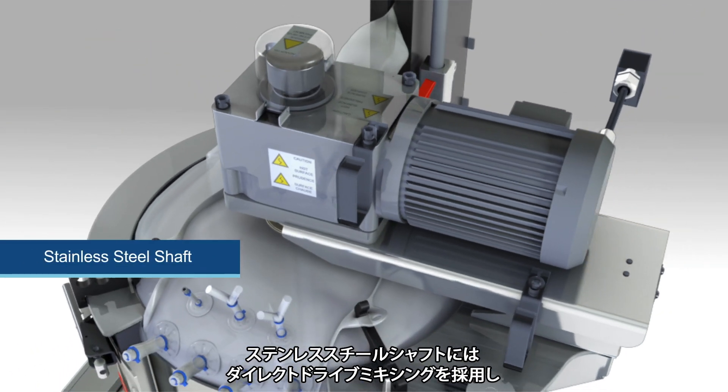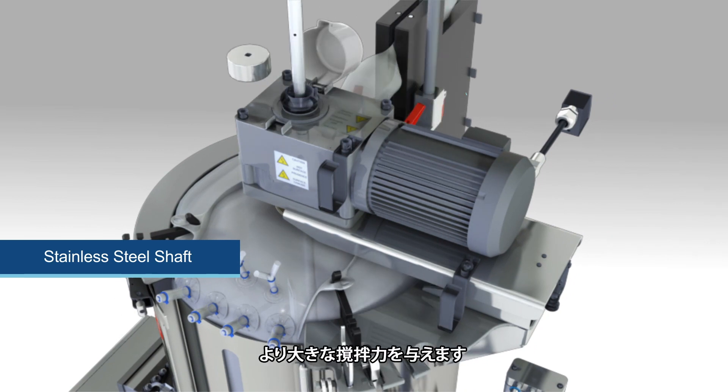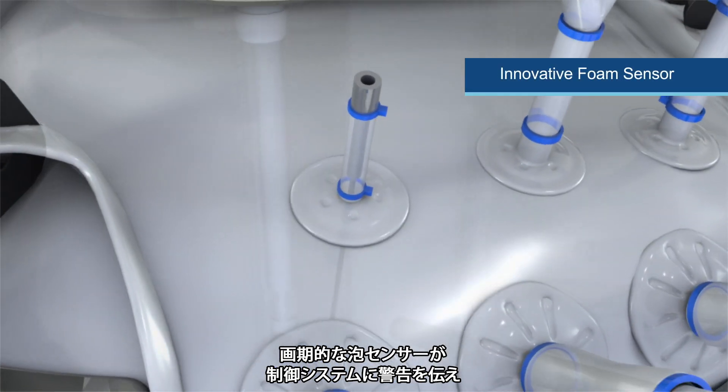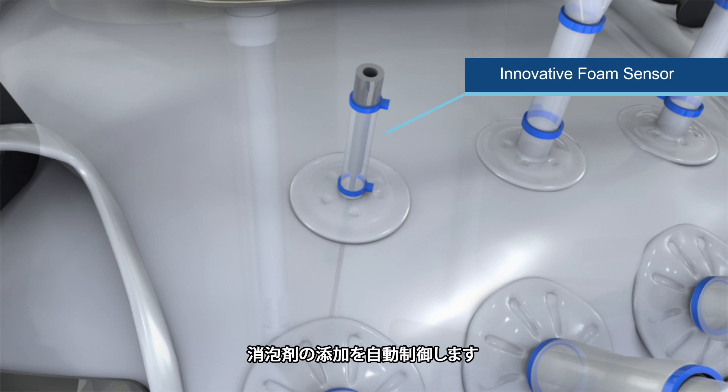A hub bearing assembly provides a sterile mechanical coupling between the motor and the BPC. The stainless steel shaft utilizes direct drive mixing for increased power-to-input volume. An innovative foam sensor uses conductivity to alert your control system, offering automated control of anti-foam addition.